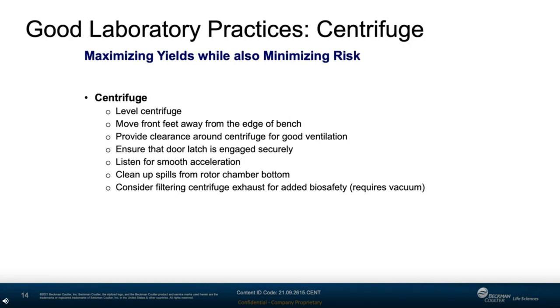The previous user of that centrifuge should have noticed a label missing from one of the samples and followed up and found it, but obviously they did not. I must add, Lori's story is a simple but real-world example of how common sense and a little care can eliminate many problems.